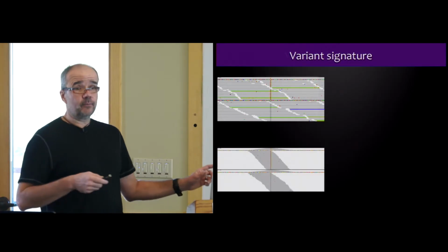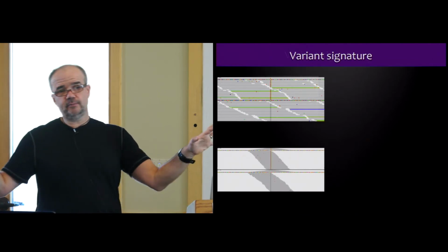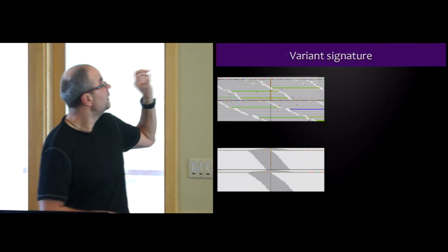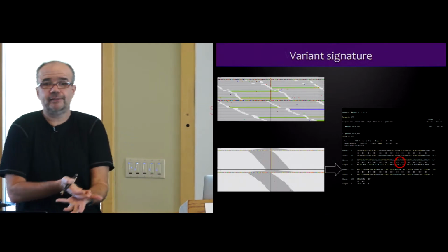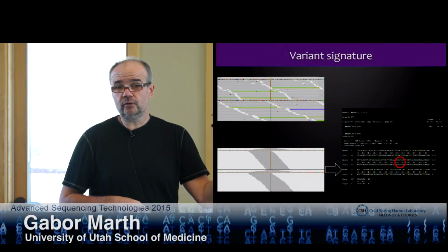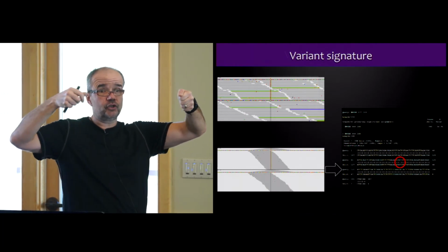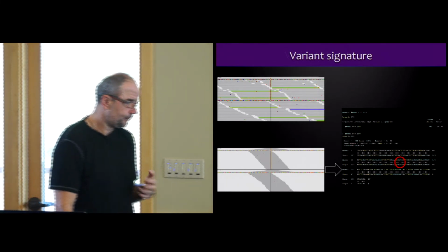And then basically this way you're able to eliminate most of your data. You end up with a fraction of a percent of the reads that you started out with, you assemble those, and then you detect. Basically, now you do comparative genomics to compare the two samples together. Okay, so there is a unique section of DNA in the tumor sample. Now you can, for example, map it back to the genome and say, where is this approximately, and then you can characterize that variant.